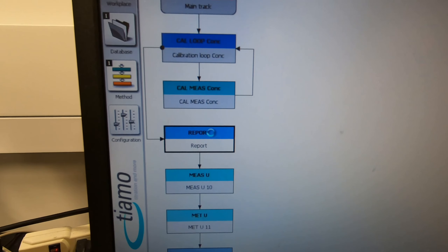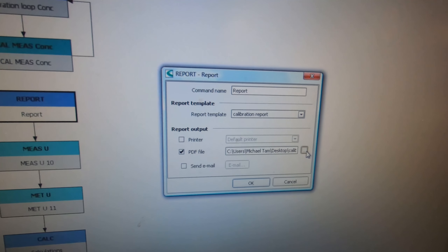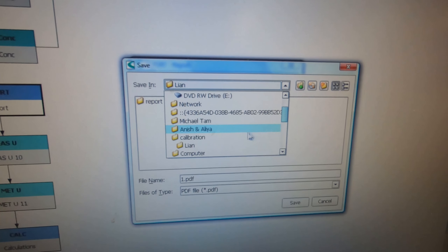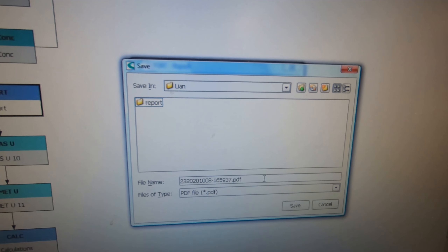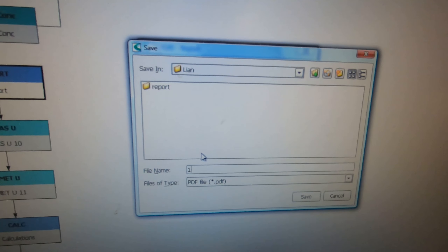Press OK. In the case of a report, there are two reports. The first calibration report will go into the folder on the desktop - calibration leon. This is the calibration report; you can change the name if you want.